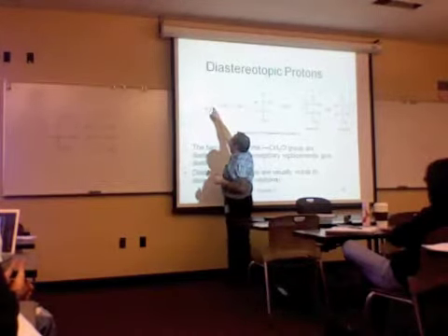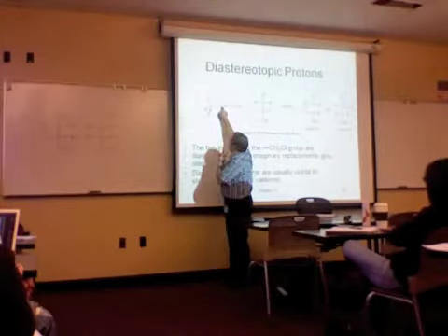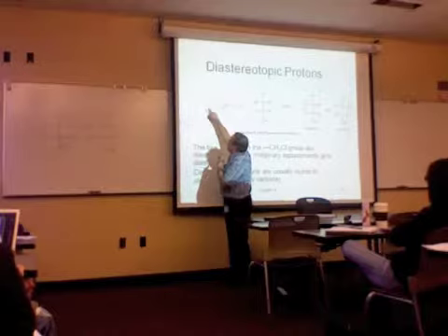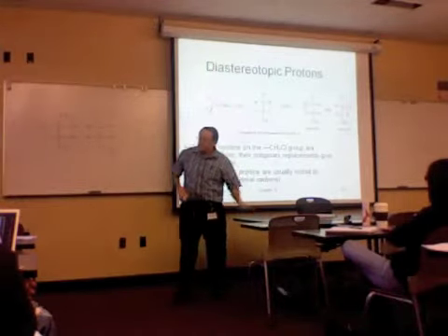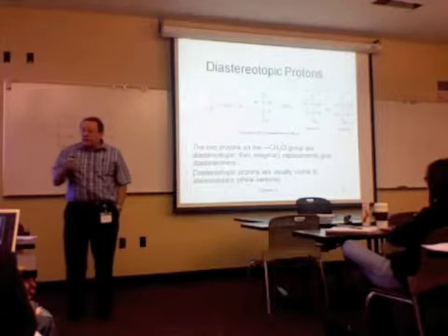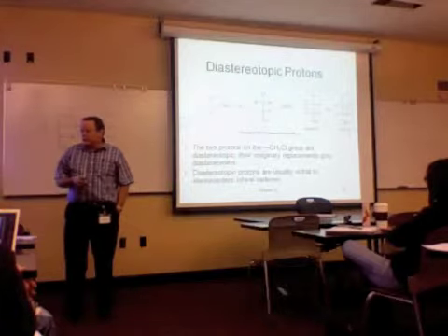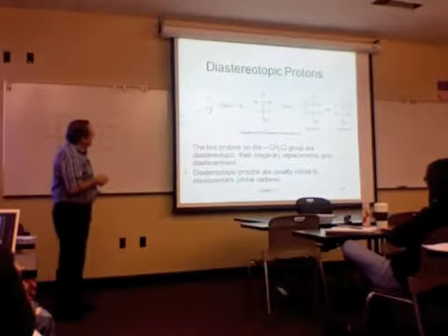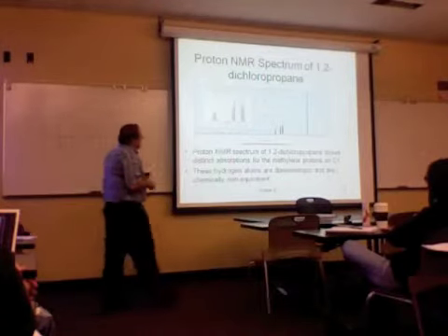But these two have a chiral environment here and a chlorine here. And so these two are in fact different from one another. If that chlorine was a hydrogen, it wouldn't affect it. So it has to be inside the chain, and it has to be next door to a chiral center for this to occur. And I think we've got the splitting pattern for this shown here.